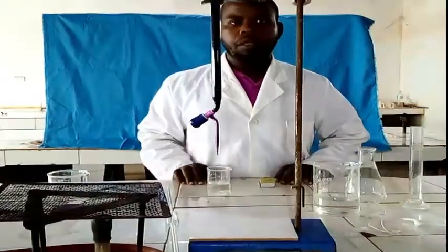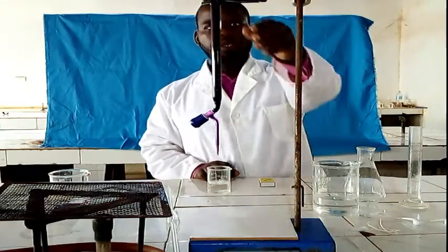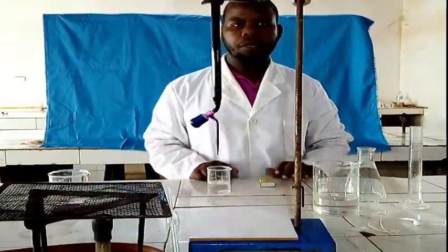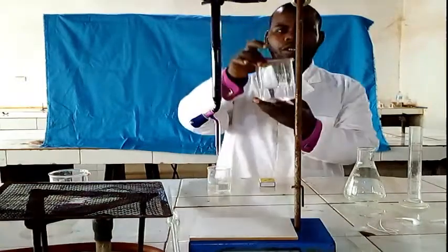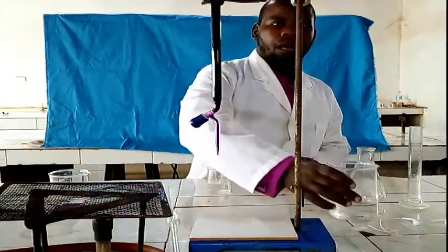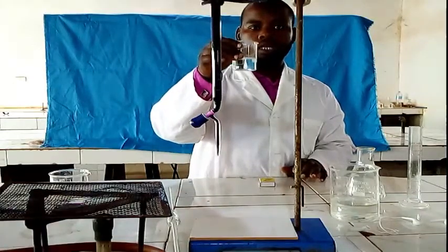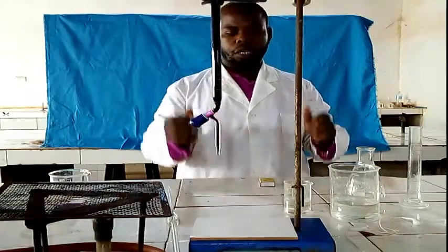So now we'll proceed with our experiment. After looking at the data, we have solution A, which is potassium permanganate, which we have already put in the burette. We have solution B, which is oxalic acid, and solution C, which is sulfuric acid, to initiate the acidic medium in our redox reaction.